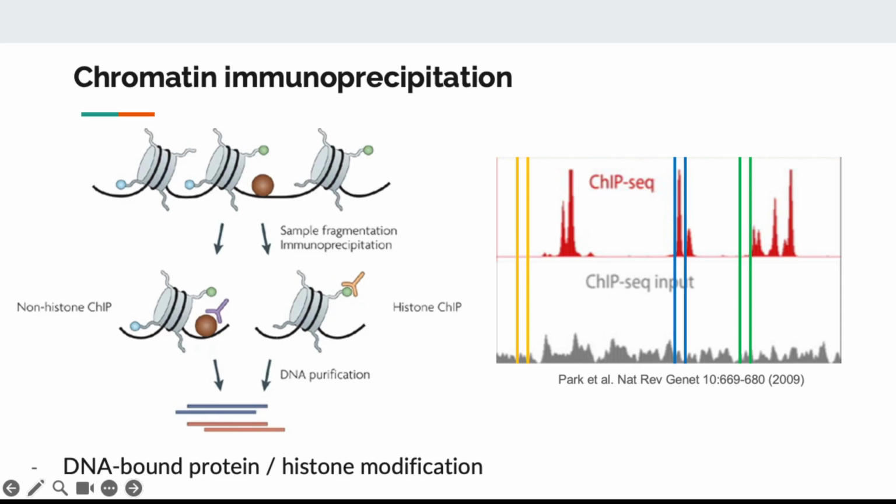These are modified, so we can design antibodies that target histone methylation, acetylation of histone, and then we can pull down the DNA that is attached to those nucleosome molecules, and we can do sequencing. So at the end, we are doing a kind of targeted sequencing, but instead of targeting with a primer, we are targeting with the antibody that binds to the protein that targets certain DNA.